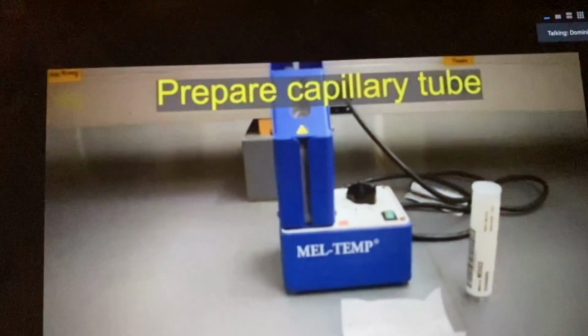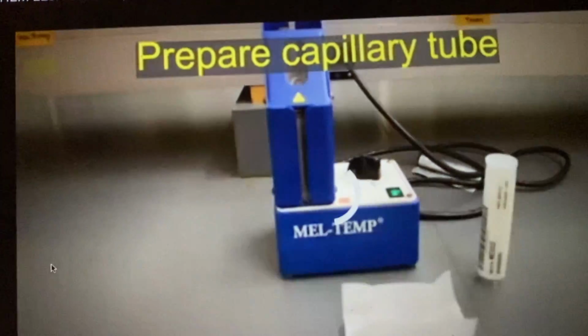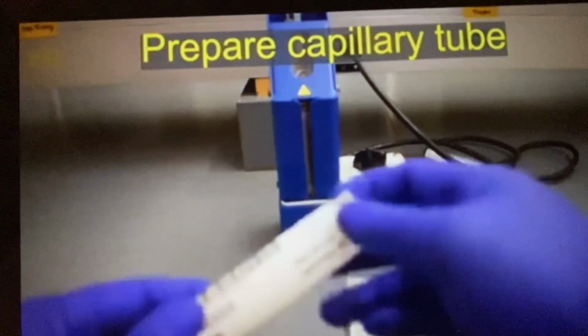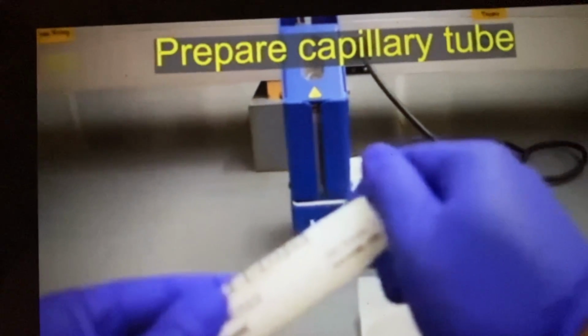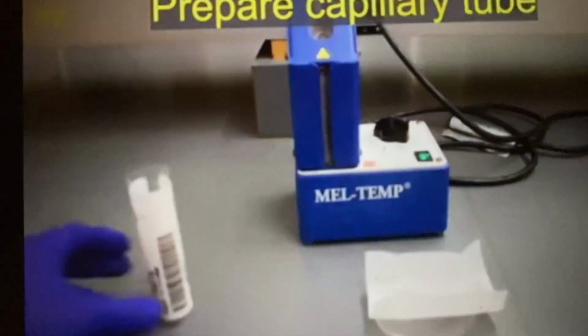This is the melting point analysis. This is a machine that you're going to use for observing the melting point of your crystal. This is a capillary tube, the same tube you use to spot TLC.